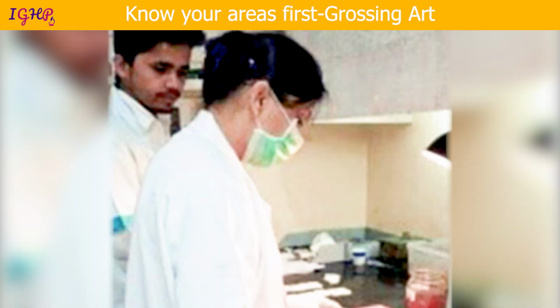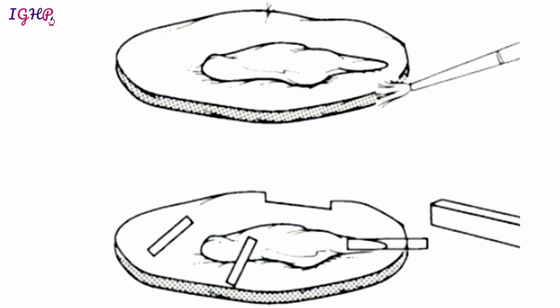So now the first and most important area is: know your areas first. As a doctor, our job starts when we enter the grossing room. Grossing, I would say, is an art, and it is gradually learned when you gross a number of specimens. But there are certain basic things to be followed for whatever specimen you are grossing. So we will look into those areas that are to be followed for most of the specimens that we gross.